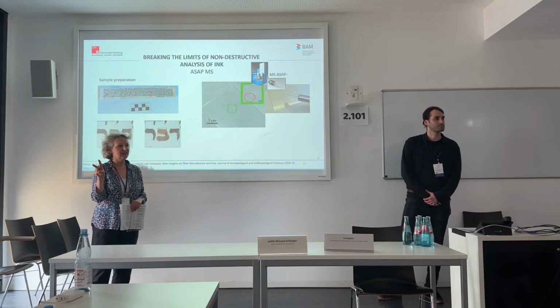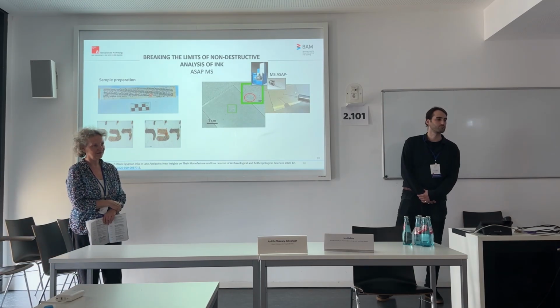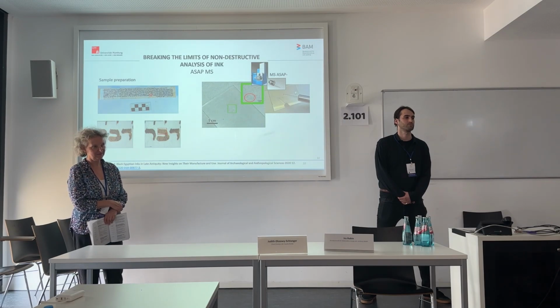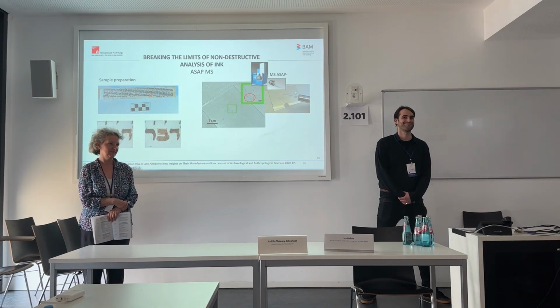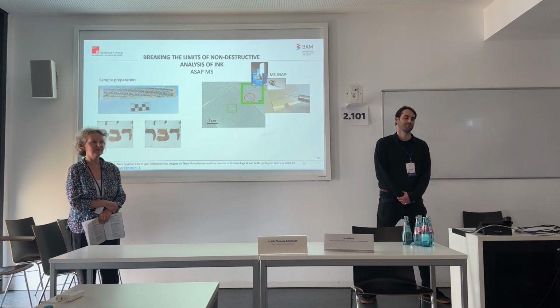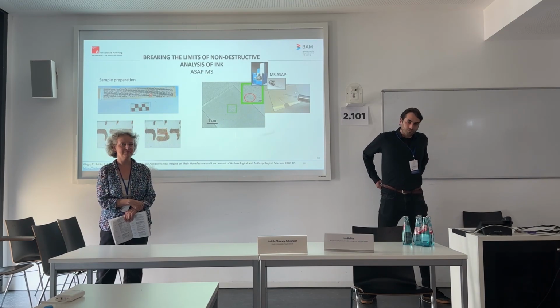May I comment, just a very small comment before? When you speak about XRF, which is a common laboratory tool, it doesn't make any damage. However, if someone invites you with your document to go to synchrotron, it can be damaging. There you have to ask more questions. But nothing that is presented here can cause damage to a document.